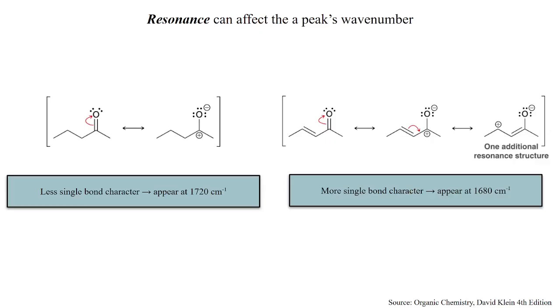For the conjugated ketone, there are 3 resonance structures. Just like the ketone, the second structure looks a lot like the second structure for the ketone. You have a charge separation and a carbocation, and for those reasons, it's not going to offer a lot to the overall hybrid. But the third one will. The third one has the charge separation, but that structure has more single bond character. Since it has more single bond character, the overall hybrid will therefore have more single bond character.